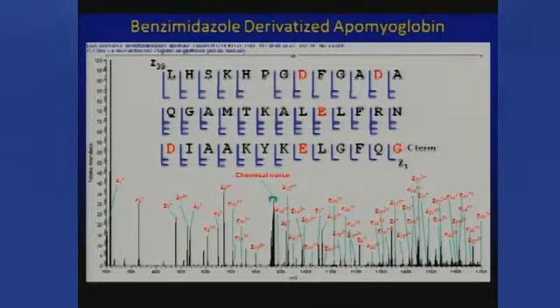Absolutely fantastic. In other words, this glycine is now basic, and its mass has been shifted by 143. So it shows up in the spectrum right where we expect, at 203. And then every other Z ion shows up, because here's another one that's been converted to a basic residue, and then doubly charged and triply charged ions. All these Ds and Es have been converted by the chemistry. And now you read in one spectrum the first 39 amino acids at the C-terminus of a protein. And it does go further.